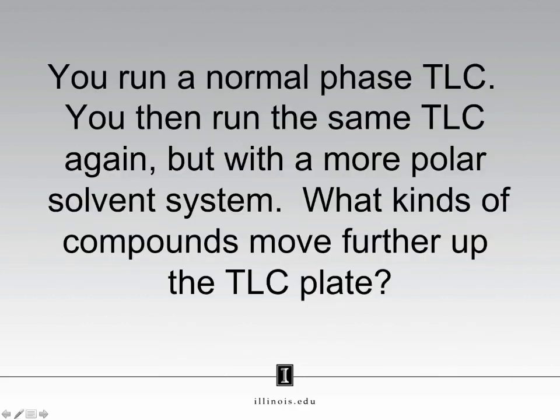That is the end for the background of a TLC experiment. But before we continue, we need to be able to answer this seemingly simple question. You run a normal phase TLC plate. You then repeat that experiment, but this time you use a more polar solvent system. What kinds of compounds move further up the TLC plate?